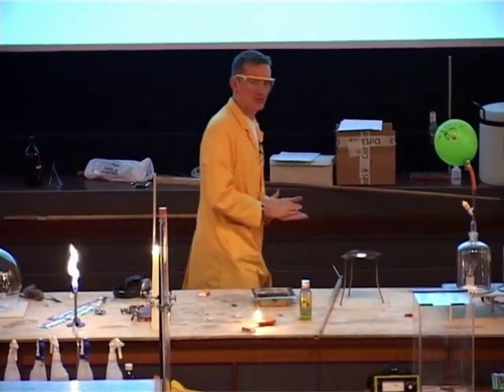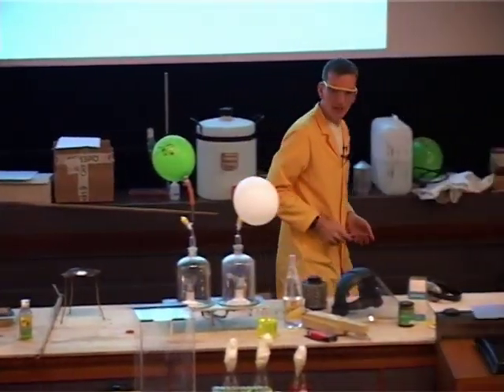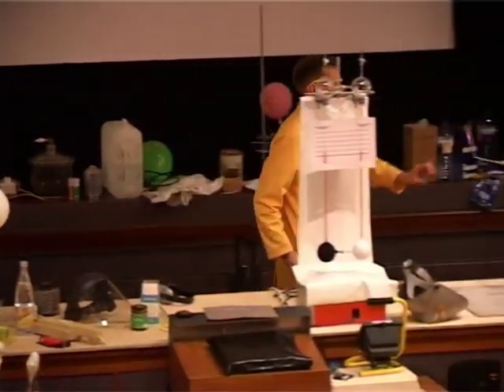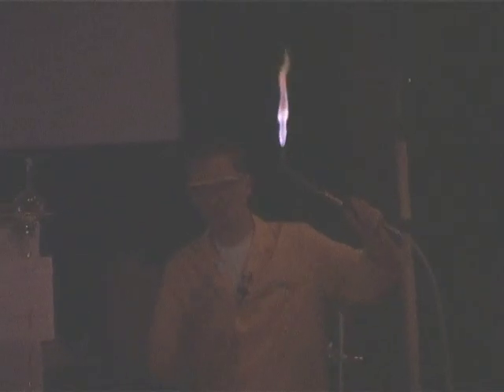Well, can we burn just any old gas then? Actually, no, we can't. Here we have some hydrogen. Hydrogen burns very easily, so this is hydrogen and oxygen burning. It's a very, very hot flame, and we'll come back to this later. But there's very little light coming out from this. So there's a lot of energy being given out, but it's mainly in the form of heat energy, not very much light. So how come our gases that are burning in the center of the stage there give out so much light?